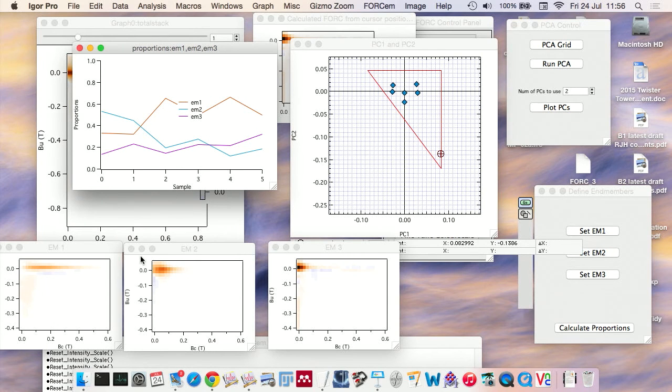And then we can physically associate this: we've got some pure vortex states in our sample with this very high coercivity ridge and the negative, and then this nucleation annihilation signature. We have some interacting single domain particles in there, and then we have possibly some very small, close to superparamagnetic type signatures in there. So just from those 6 samples, you can explore this space and tease out these different signatures and actually turn them into a quantitative measurement of what proportion of the irreversible magnetization in your sample is explained by each of these components.